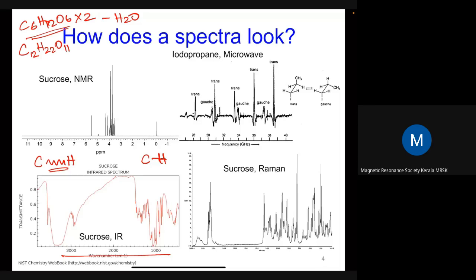And what you're able to see is that there are different stretching and bending vibrations that are present in the sucrose molecule. Of course, the ones that are actually visible in Raman might not be visible in IR and vice versa, making them complementary techniques to understand what vibrations are present. Of course, IR and Raman use a higher energy, as you might remember, but it still doesn't perturb the molecule. It might heat up the solution a bit, but not as much as you might imagine.